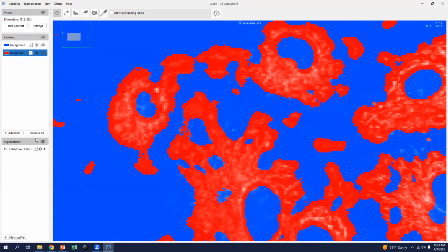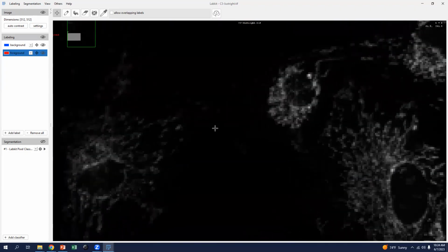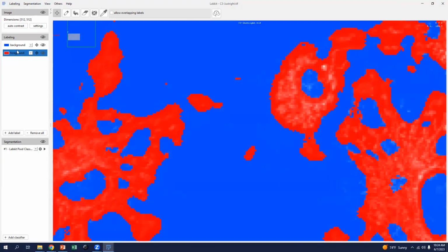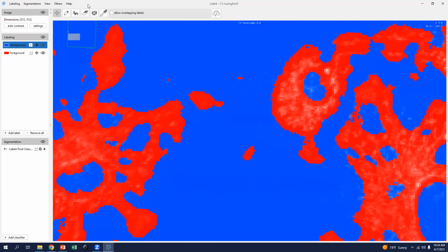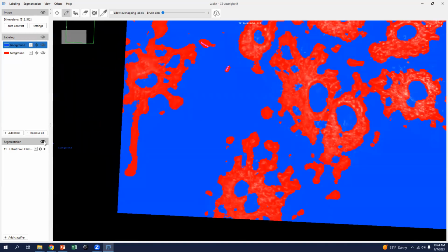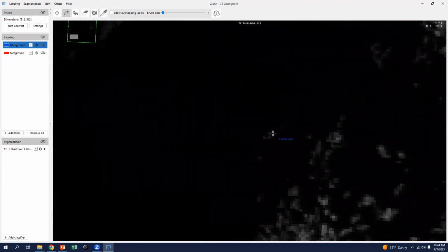And yeah, these two are very dim. But here, there's nothing that we can see. So we'll do those. And this.